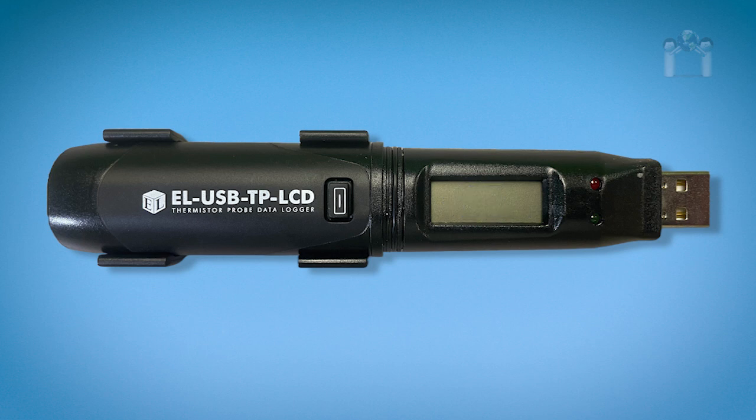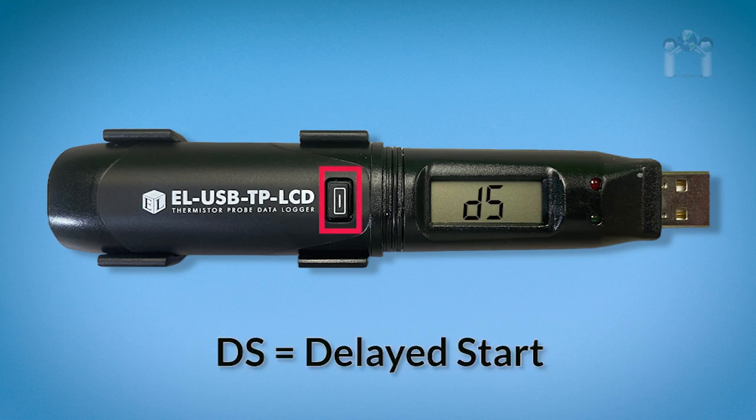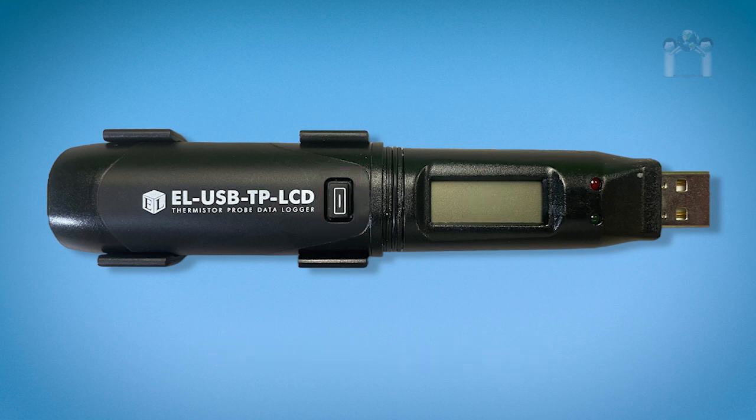If the data logger is primed to start at a specific date and time, DS will appear on the display when the button is pressed. If the LCD is set to always on, the temperature will automatically appear after the start time is reached.